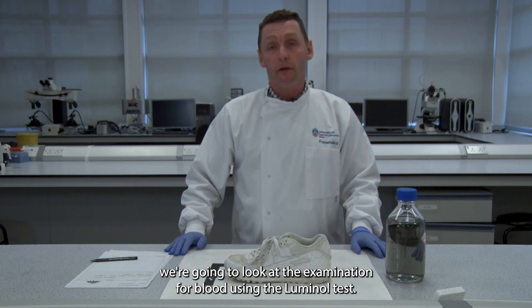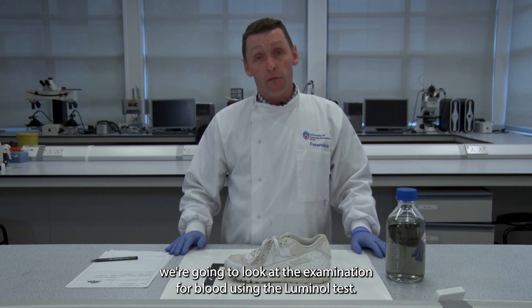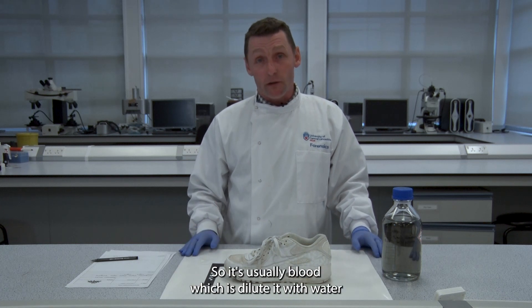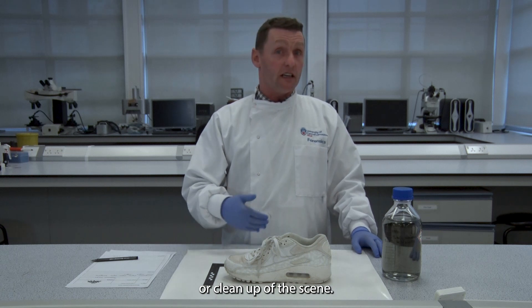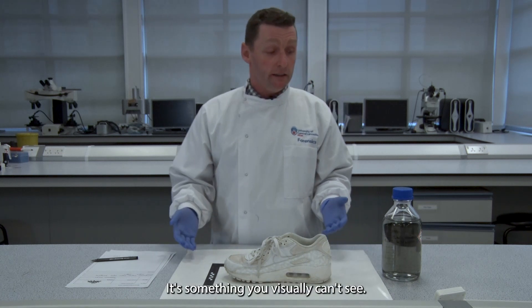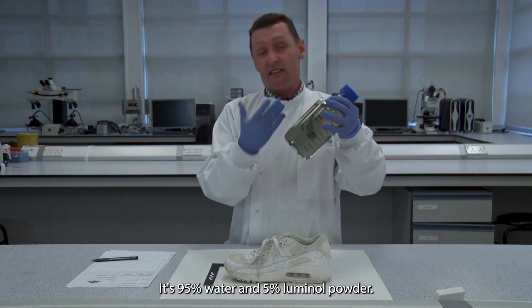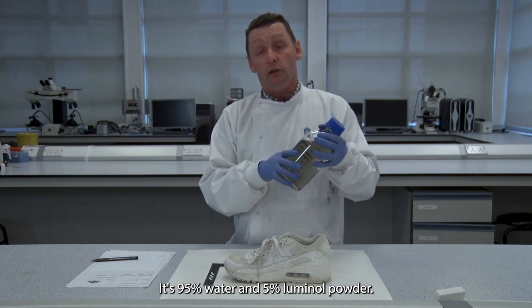In this tutorial we're going to look at the examination for blood using the luminol test. The luminol test detects blood that you can't see — blood which is diluted with water or from a clean-up of a scene. It's something you visually can't see. Luminol is a transparent liquid: it's 95% water and 5% luminol powder.